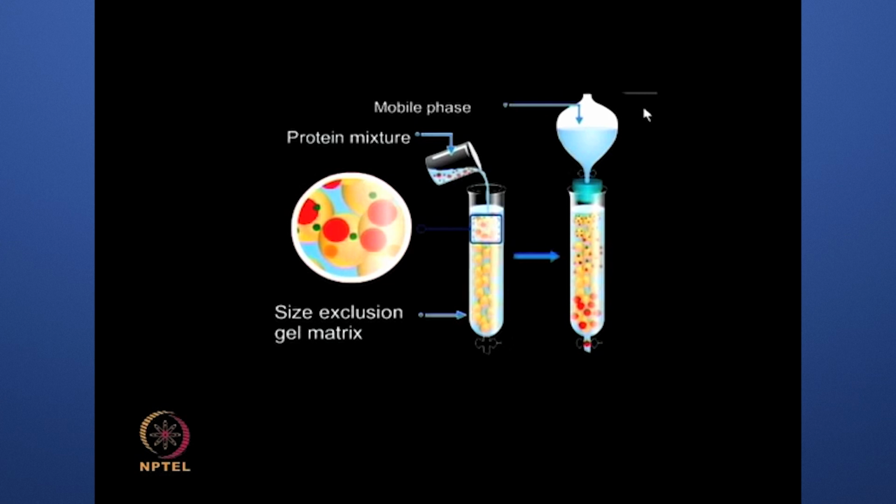of the column. Mobile phase. The proteins are eluted out of the column by using a suitable mobile phase that carries the protein out for elution. For gel filtration, a salt solution of appropriate strength is commonly used, so that it will not have any effect on properties of the proteins being purified. Solvents or buffer systems are often used in other types of chromatography.